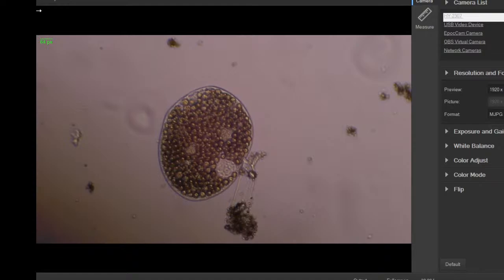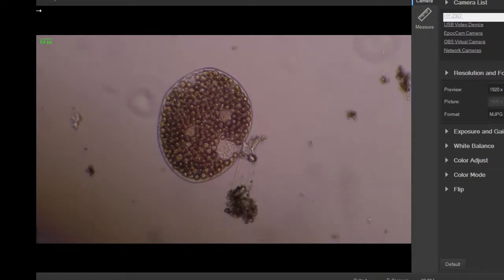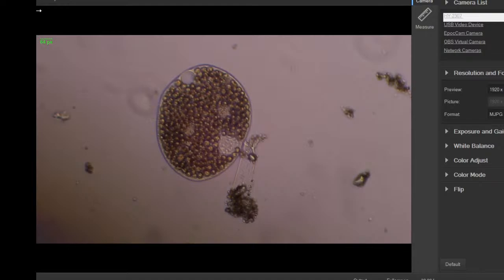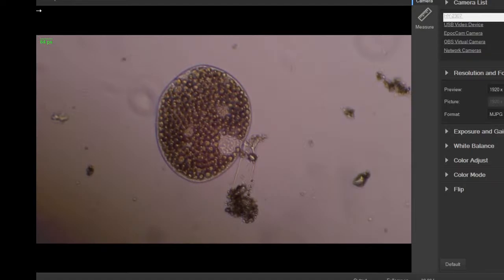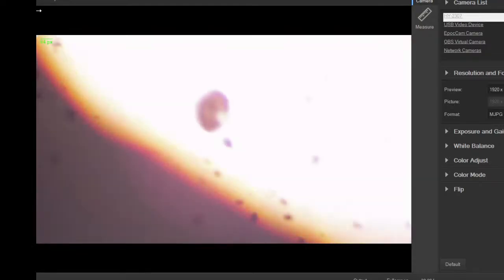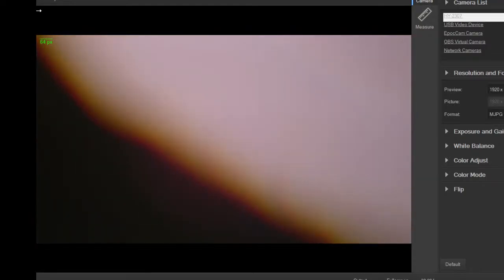Yeah, there's that wind current again. That little whoosh is going through there. Yeah, slide is starting to dry up. You get like a wave front coming through as the wall of water starts to shrink. Alright, I should give this guy a break. I don't want him to meet an untimely demise, so let me get him back in the bottle.